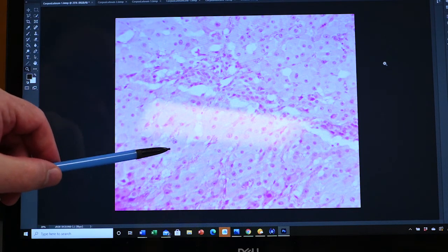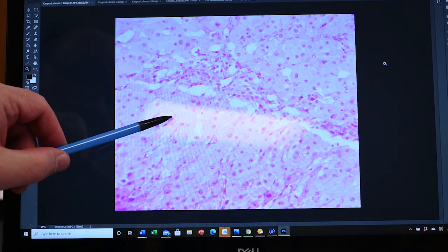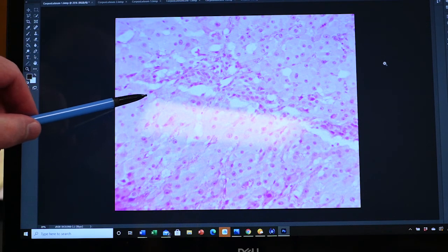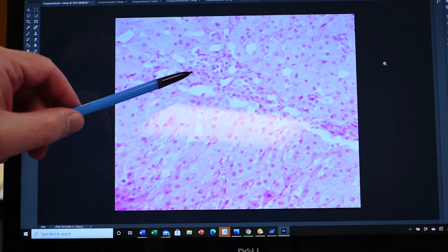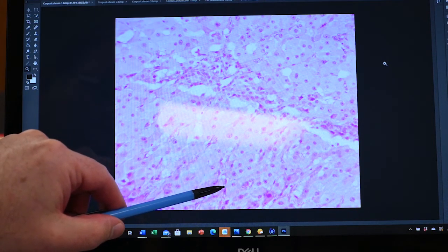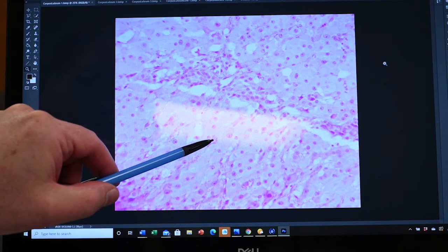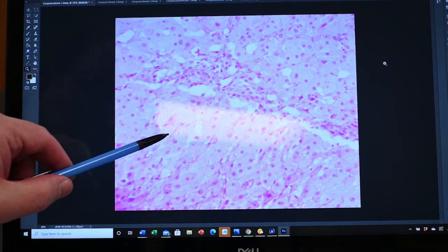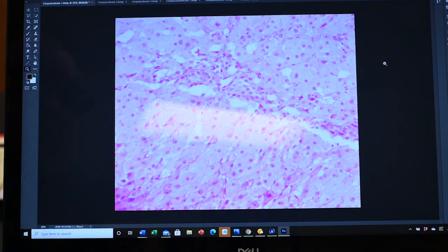Remember that the granulosa lutein cells were thought to be more involved in production of progesterones, and then the theca lutein cells in the production of estrogens. This doesn't show very well the material from the theca externa, but there's little bits of that fibrous tissue showing up in here, and there are blood vessels going through in here because, remember, this is a hormone supplying structure for quite a while.